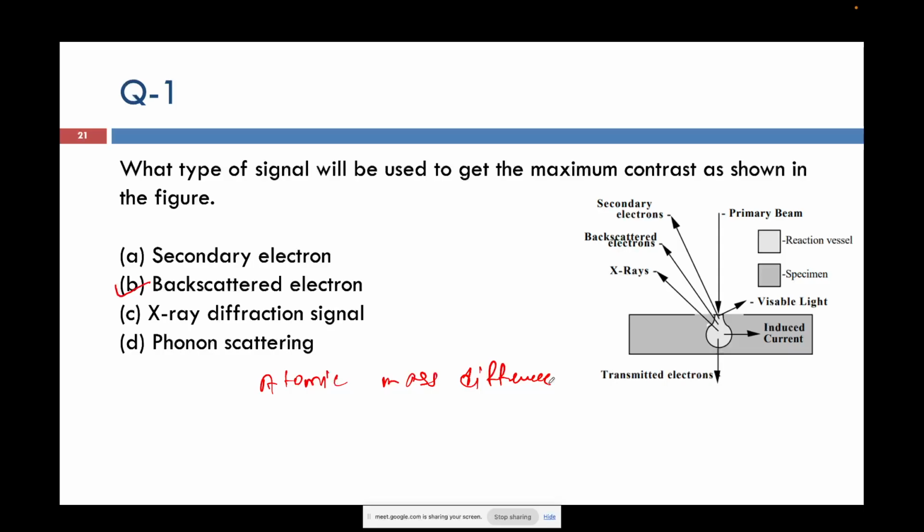In fact, if we want to see, let's say I prepare any material, we will see in the subsequent questions, if we want to see any kind of secondary phase or any other phases that are present, or different kinds of precipitates, anything we want to see apart from our parent material, we go to this backscattered BSE mode.